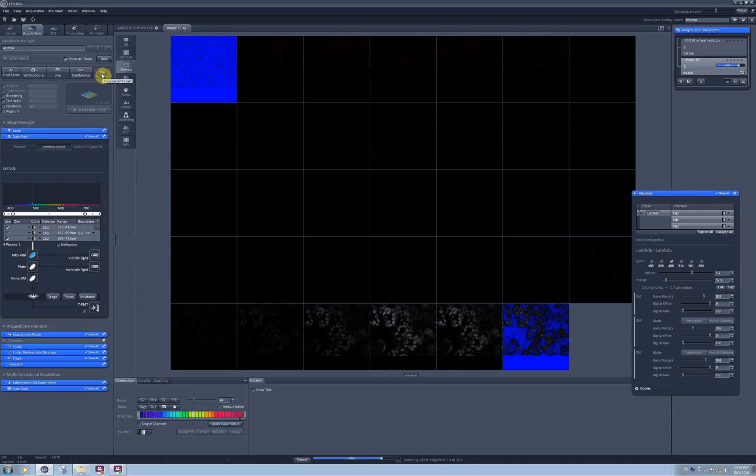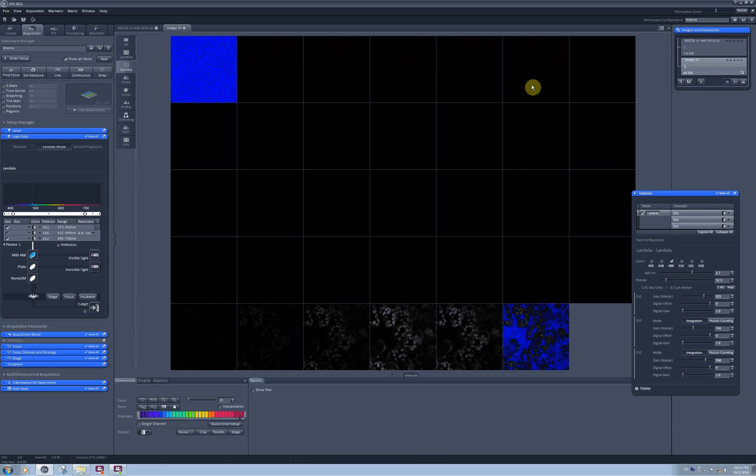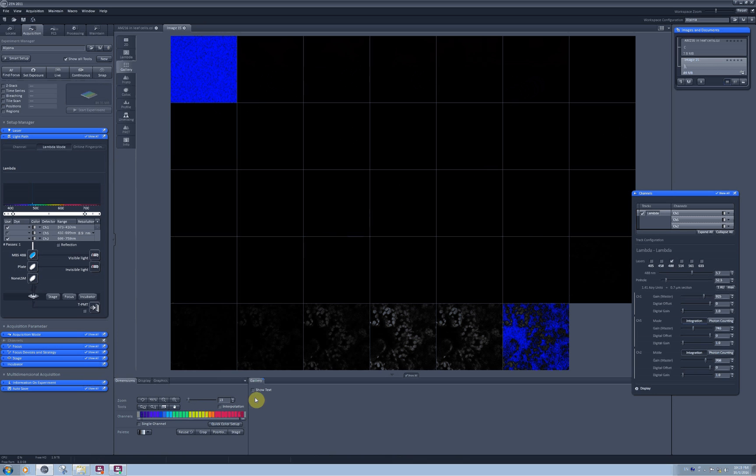When I click on snap now I will be able to see images provided by each individual detector present in the system. Again we have 34 detectors and these are 34 images.